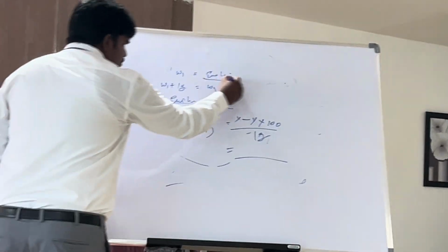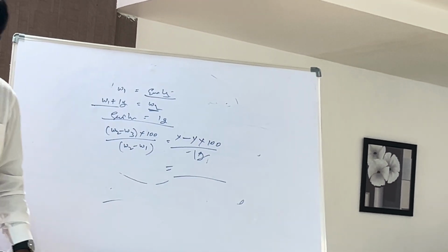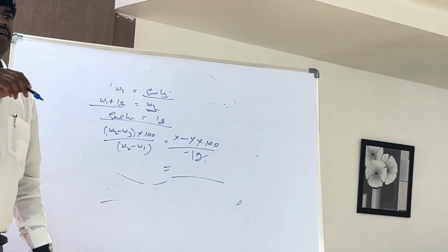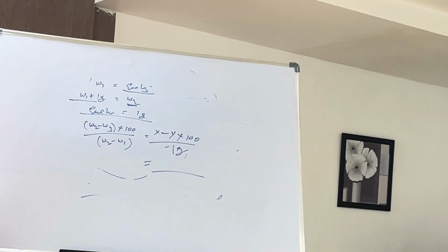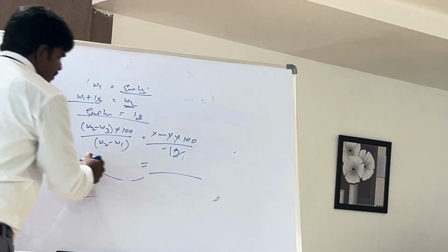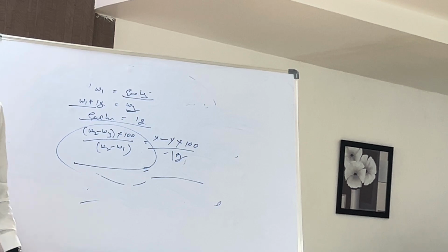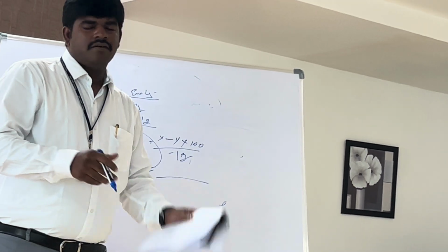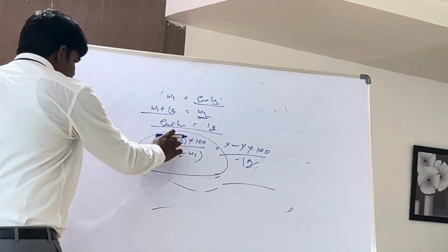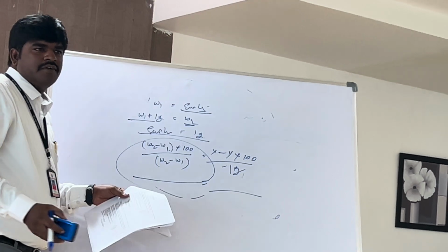You take the empty crucible and you take the sample and you treat with the H2SO4, and after treating, again you keep it in the muffle furnace for 1 hour, and again you need to cool, and again you need to weigh. The formula is similar. W2 minus W3 into 100 divided by the sample weight. But it is also similar. Okay?